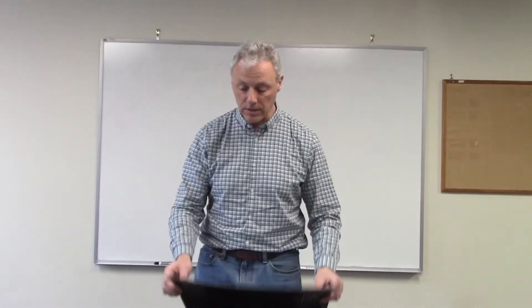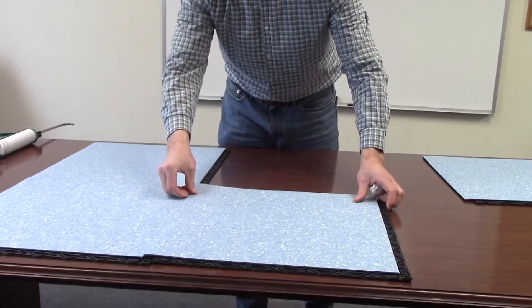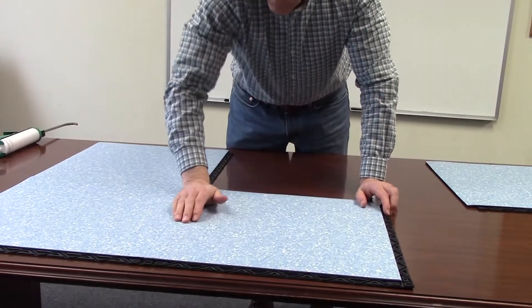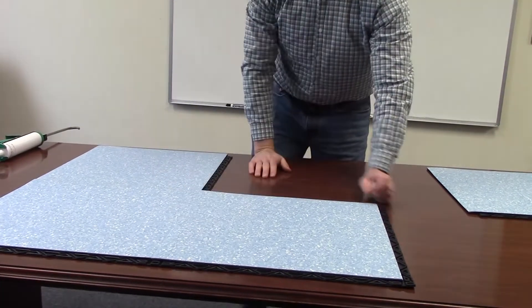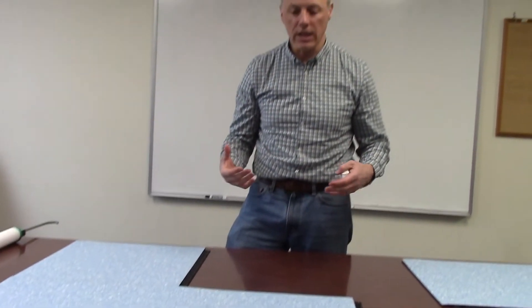Again, this is our product Freestyle Biolock. The way it's made, it has two exposed interlocks and two overlapping interlocks. The nice thing about this product — and I have two assembled here — is that because of the overlapping feature, it gives you a very tight seam that is very liquid resistant. In most applications, just installing it like this is perfectly adequate. It's going to give you the tightness you need, plus functionality, portability, and it's super easy to put down.